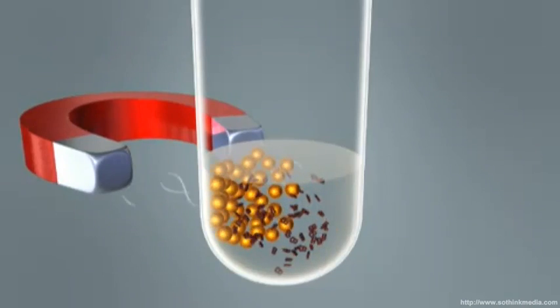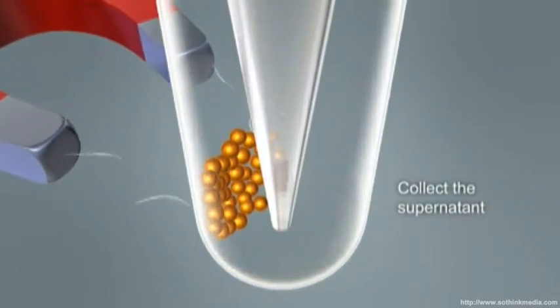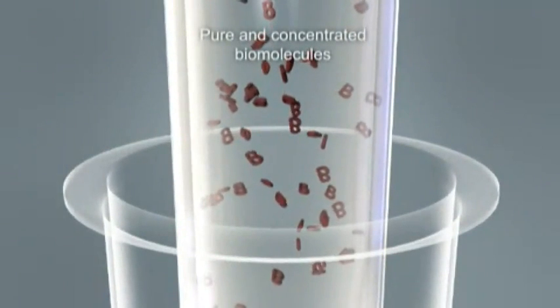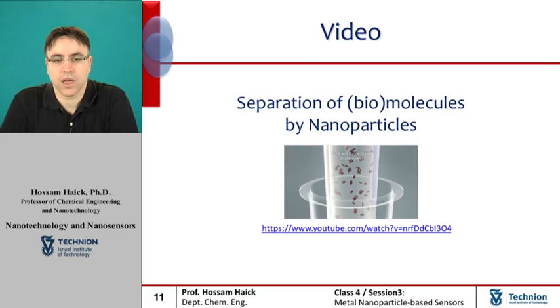Right now we see on the screen step number 2, where the magnetic force is collecting the nanoparticles to a specific location. Afterwards, a new pure solvent is added and the wanted molecules will diffuse or dissolve in the solvent. The magnetic collection of the nanoparticles is repeated, but this time the particles are not connected to the target molecules, and those can be isolated.